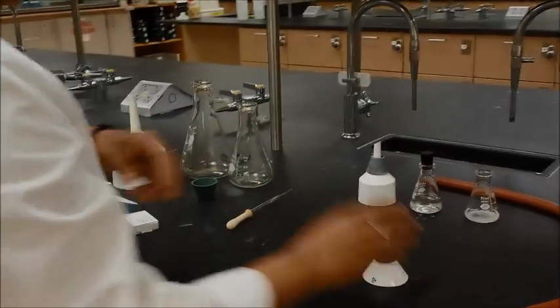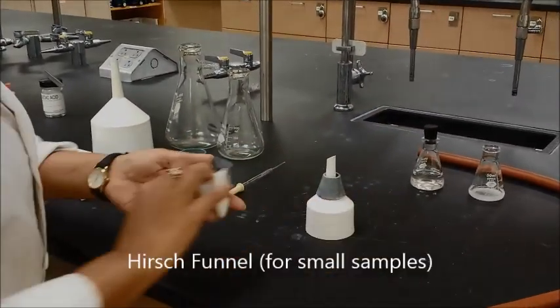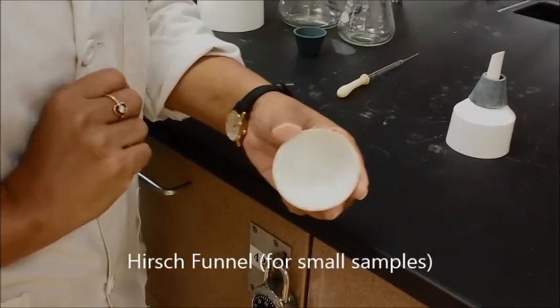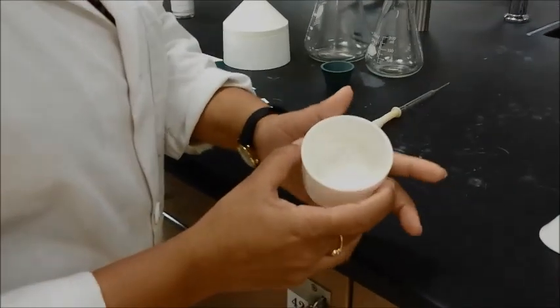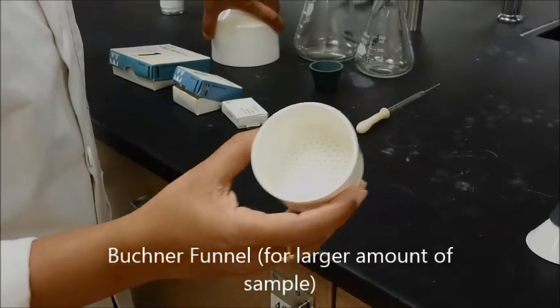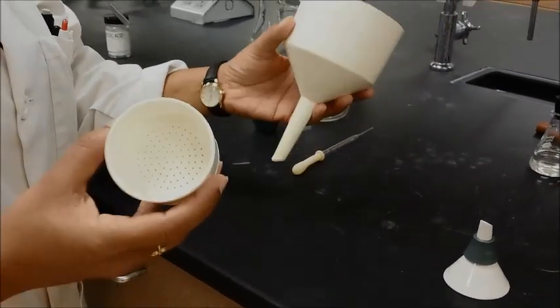Then you will need either a Hirsch funnel or what we call a Buchner funnel. The Hirsch funnel is very small, it's for small sizes or small amount of sample. When you have a Buchner funnel, you can have a Buchner funnel like this, which is this size, or you can have a larger one also, because it depends on how much sample you have.